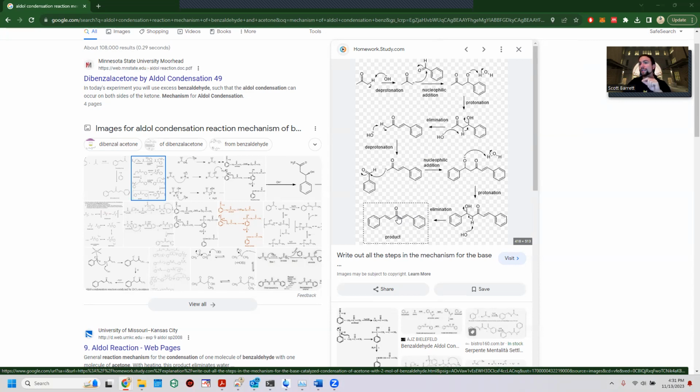So that would be kind of similar to your original acetone in terms of that carbonyl ketone peak, probably about the same since it's not very much different in that case, but you would not exhibit any sort of aldehyde peak regarding a carbon. So those are the main things to review when you're going to look at analyzing these materials in terms of IR and NMR.